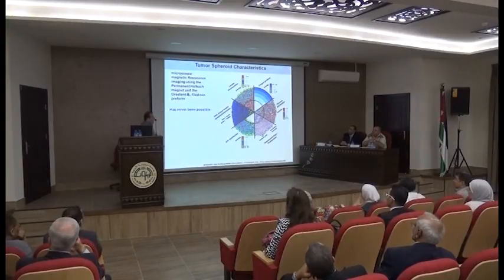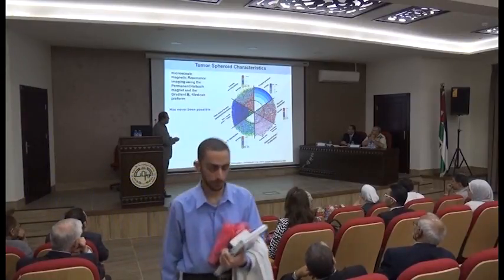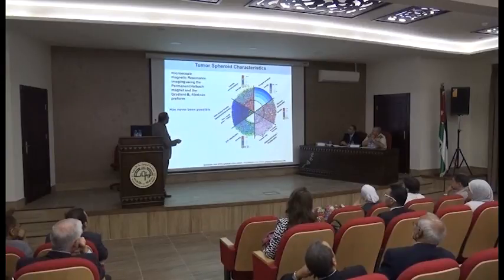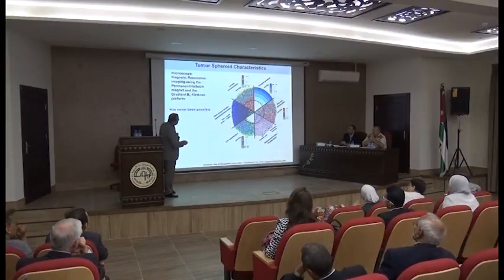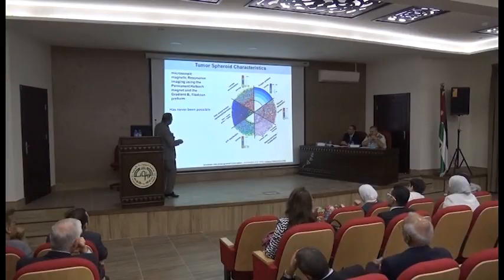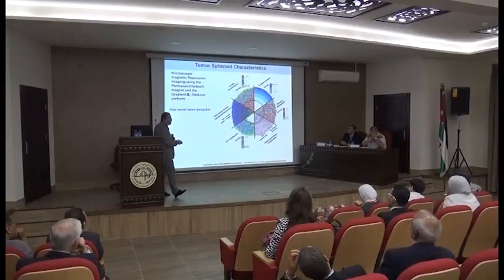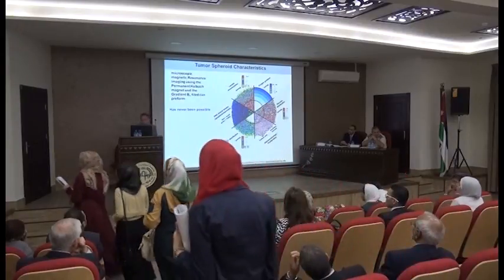Now at the last slide, I come to this point. This is the image of the spheroid done by micro imaging. The spheroid is just 9,000 cells. It's a model for a real organ, and you see inside the oxygen gradient. You see the distribution of this information just from the imaging. Lactate distribution and concentration were also checked by correlation, and so on. All the 23 components can be studied this way, by just a spheroid. And this is the successful measurement for micro imaging.